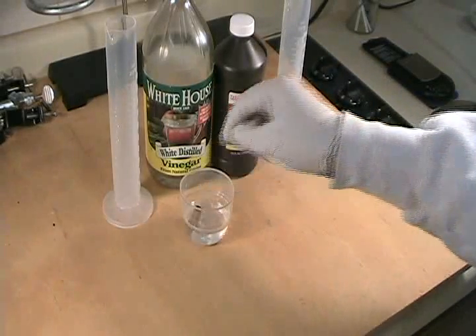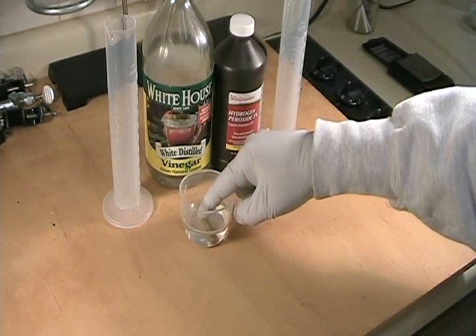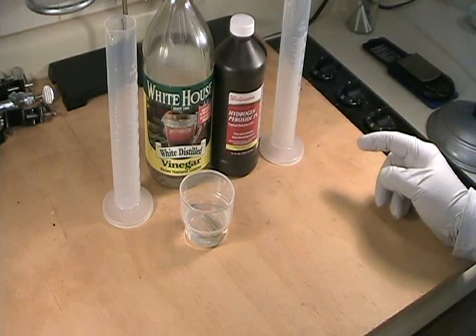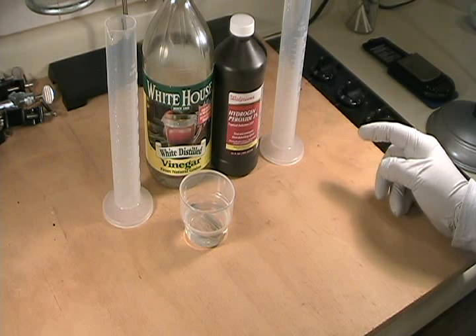Then just drop the cartridge case in and make sure it's fully immersed. It may want to float on you, so hold it down and then just wait. At first nothing will appear to happen. Eventually within 5 to 10 minutes you'll see the solution start to turn a bit greenish near the cartridge case.